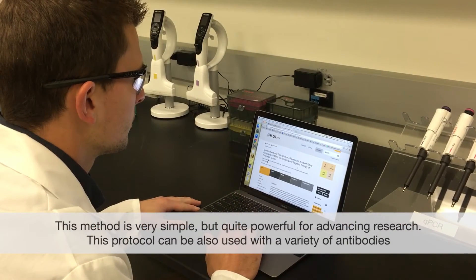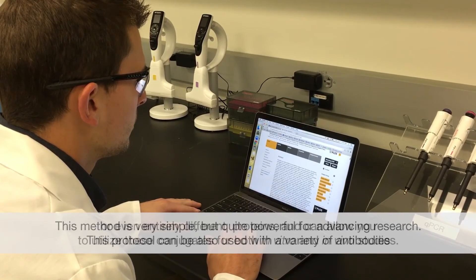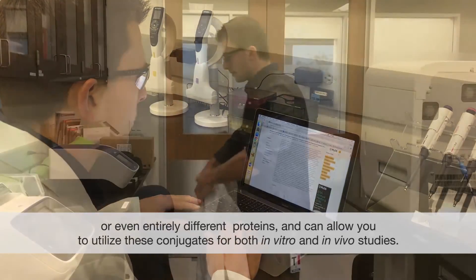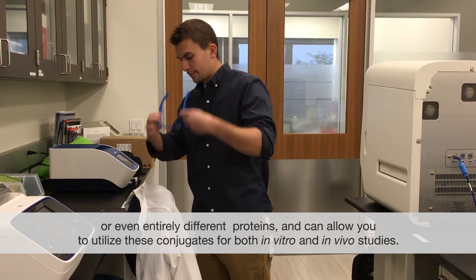This method is very simple but quite powerful for advancing research. This protocol can also be used with a variety of antibodies or even entirely different proteins, and can allow you to utilize these conjugates for both in vitro and in vivo studies.